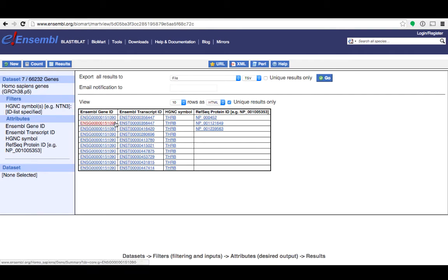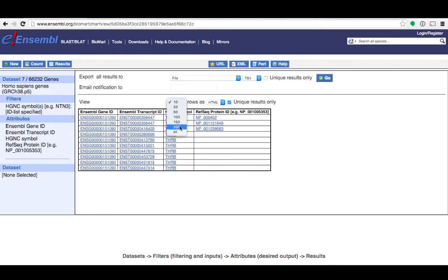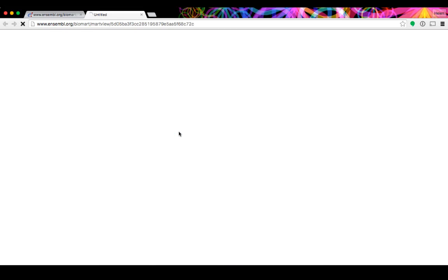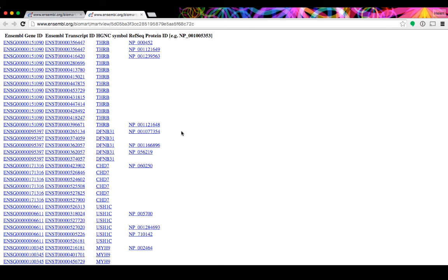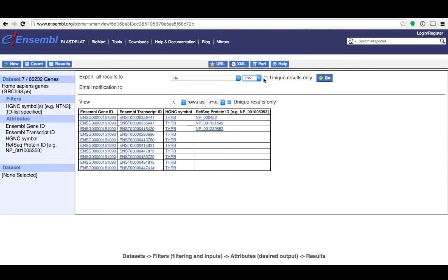Each attribute that I chose is shown here as a column. If you're unhappy with any of your selections you can go back to attributes and pick new ones. To view the rest of your data you can click on this drop down and select all. A new browser tab will open with a table of all of your data. You might prefer to save your data as a file in which case you can choose your file type here. You should click unique results only and then clicking go will download the file to your downloads folder.